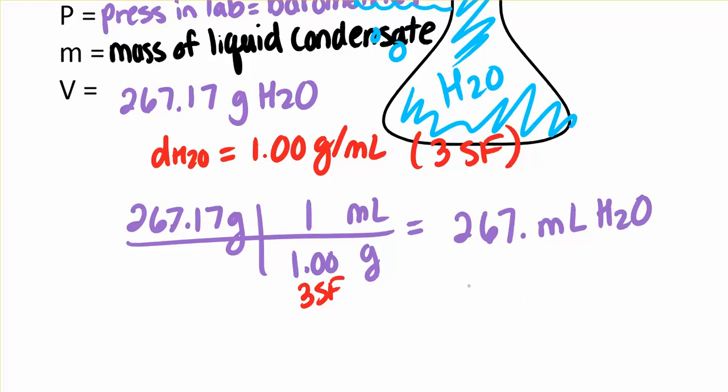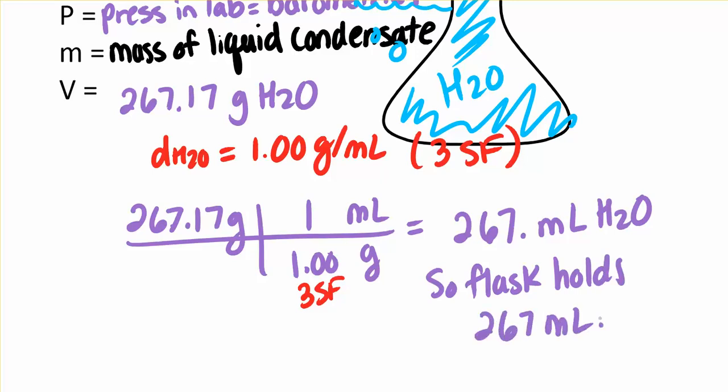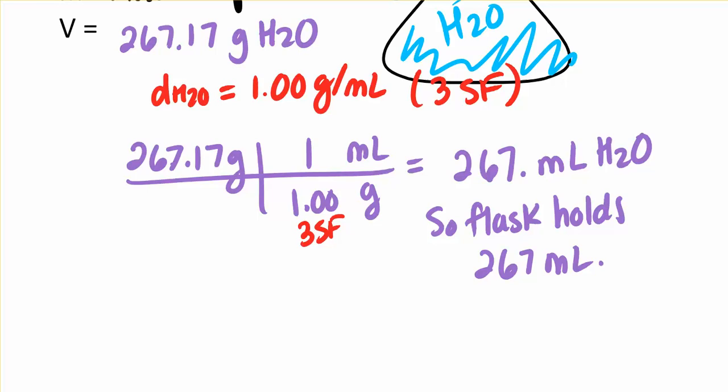So how big is the flask? So what is my volume of my unknown vapor?